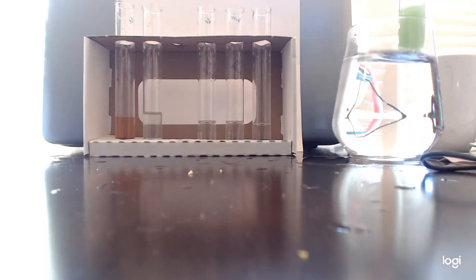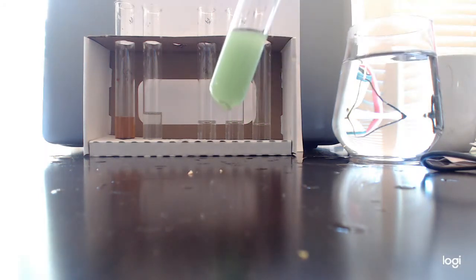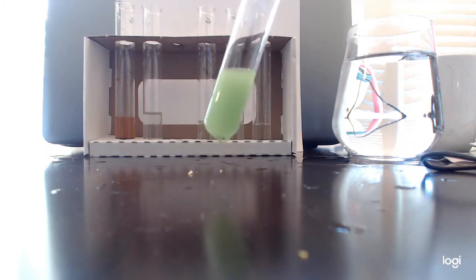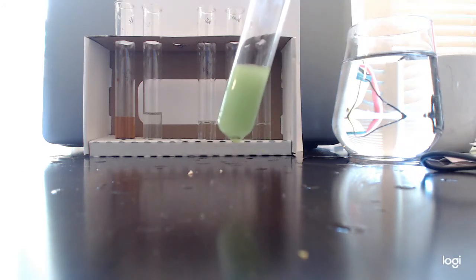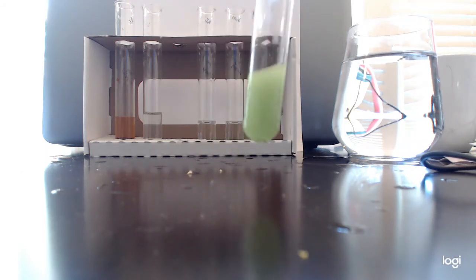That's proper Slimer green. Now let's go ahead and think about the scientific interpretation of this. If a Benedict solution has changed color from blue to yellowy, reddy, greeny, orangey, and it's precipitated, is it a positive or negative result for sugar? And if you're thinking that this is a positive result for sugar, you're absolutely correct.